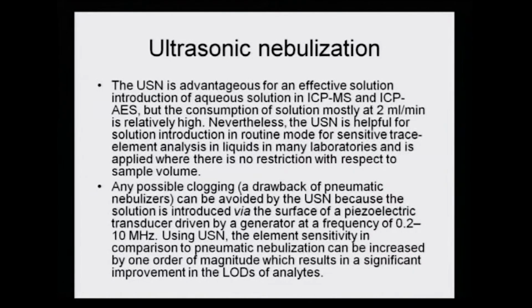Nevertheless, ultrasonic nebulization is helpful for sample introduction in routine mode for sensitive trace element analysis in liquids in many laboratories, and is applied where there is no restriction with respect to sample volume. So, this is a sensitive method, and it is mainly used for trace element analysis in liquids, and especially where there is no restriction for any kind of sample volume.